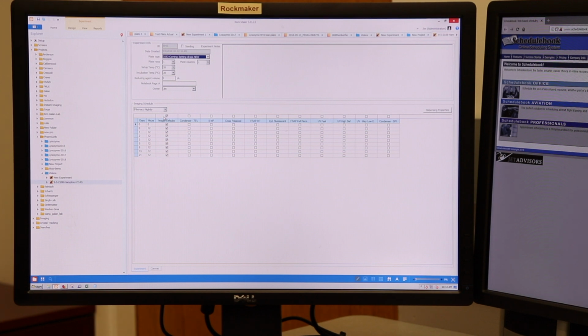So this is the default setup, where you're imaging in Imager Default, which is basic visible imaging. Under certain experimental conditions, there are other imaging possibilities. Have the condenser on, you can do cross-polarization, fluorescent imaging, and a couple of UVs. Typically, we don't UV image the entire plate every time. It takes quite a while. You want to image individual wells with UV.